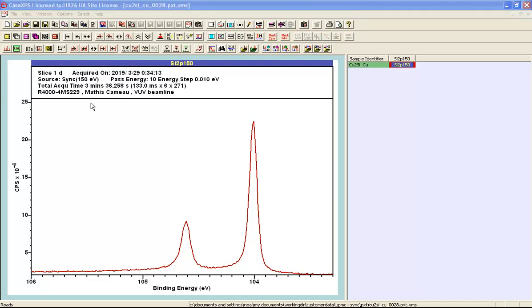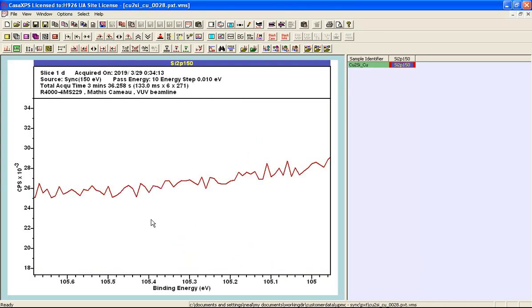The context for data is always useful. In this case, because this is a Scienta Omicron analyzer and we've got a beamline, then one of the things we ought to work out is the relationship between noise and the signal within these data. And this is important when we want to construct a peak model. We need to have a target for our figure of merit, and in order to work out what that target should be, we need to consider the data itself and not simply assume that we're aiming for unity, which you might expect for purely pulse counted data.